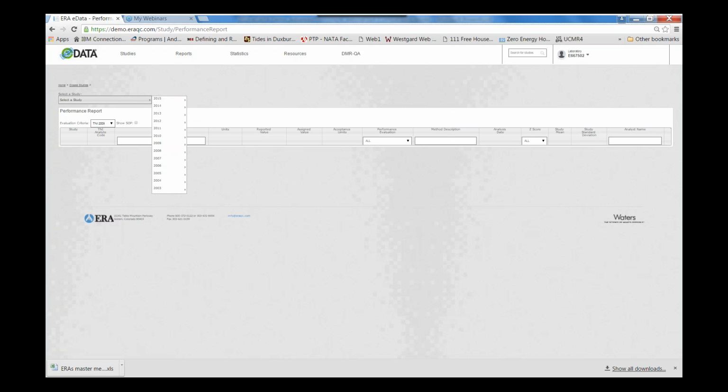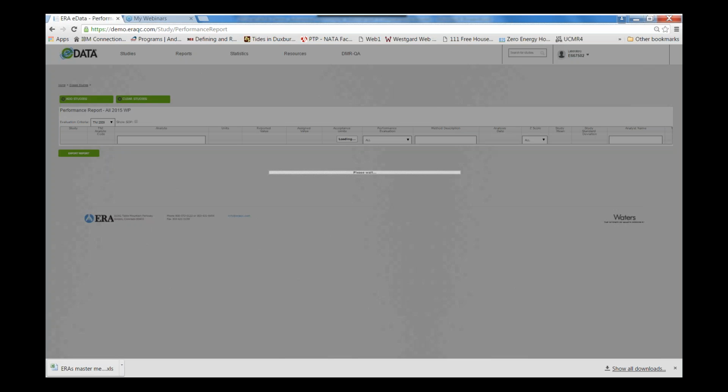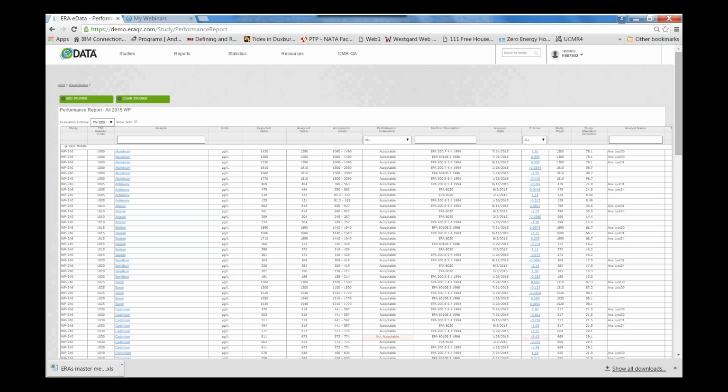Again, this is that detailed look at our performance. In this case, I'm going to go a little bit farther back. I don't want to just look at my last study, but I want to take a look at all the studies that I've done in 2015. So I'm just going to click on WP 2015, and this is going to bring up both studies that I participated in. You can see over here we've got WP 246 as well as WP 240, all the analytes that we participated in.